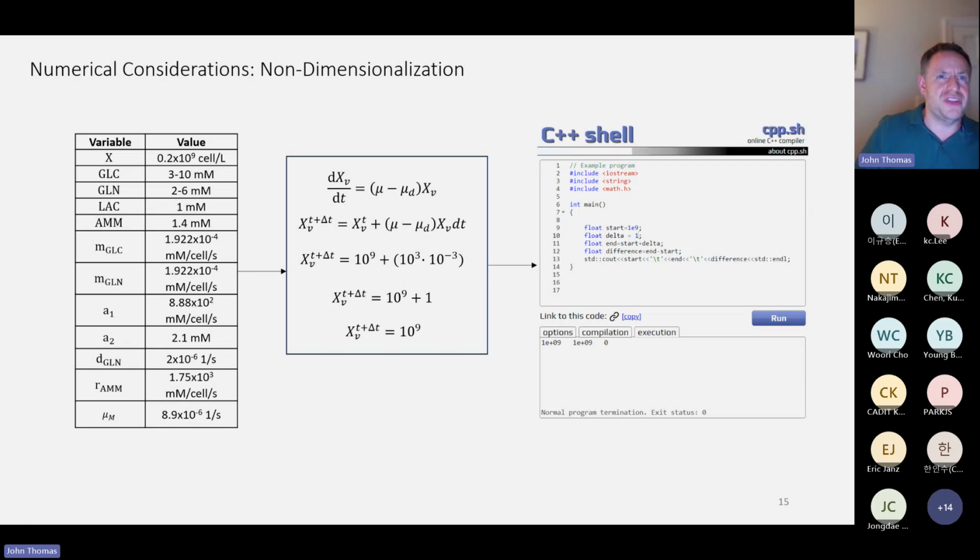Non-dimensionalization is routine with these simulations, but it's necessary because we're going to be modeling a system with an impeller moving dynamically, with bubbles moving dynamically, a time step on the order of, maybe a millisecond or less. We're going to have very slow reactions that take days to complete. So in order for us to be able to handle that disparity in just machine precision, we're operating with dimensionless values. This is a pretty specific point, and I'm happy to address it in more detail should folks want to have a sidebar discussion at a future date.